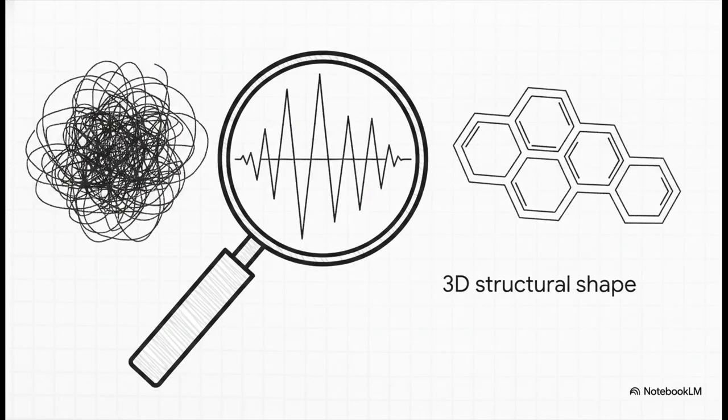Okay, real quick, before we get to the heavy-hitting tools, we need to call out a bad habit. The source material refers to it as the lazy way out. When looking at complicated overlapping resonances, some chemists just label the peak a multiplet and move on. But doing that is literally throwing away a goldmine of data. Those intricate coupling constants, especially the differences between axial and equatorial interactions, are the exact keys to unlocking the 3D stereochemistry. We really have to look closer.